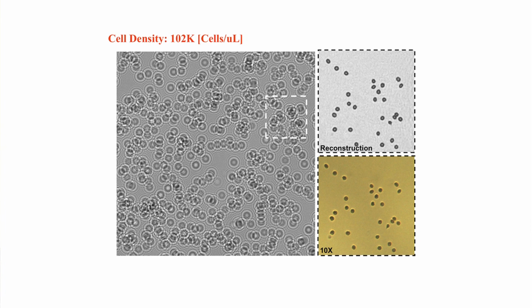In a dense sample, these shadows are still okay in different regions, but in denser parts of the sample, you can't really understand what's going on because of the overlap. But these shadows are actually not just dummy shadows. They contain interference of light in the form of digital holograms that you can actually reconstruct, time-reversing optical fields using a computer or using a processor in your cell phone.